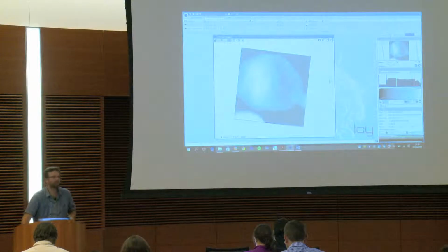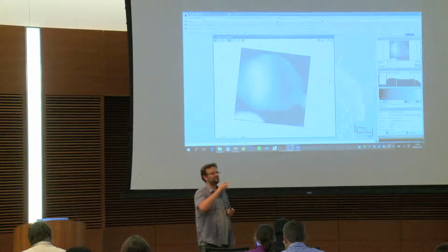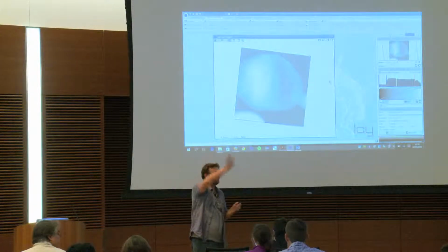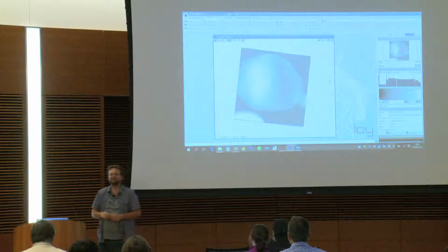Okay. So you are listening, or you are doing the same with your computer? Because if you are not doing the same with the computer, I can go fast, I don't know. Who is doing it at the same time? Nobody? No one? Okay, great. Two, three, four. Maybe because Stephane is there, so you are helping people. It's great.